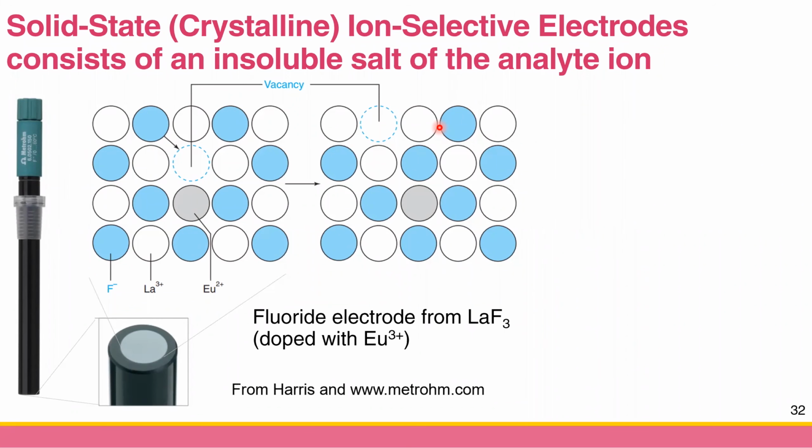For example, if we want to measure the fluoride ion, then we can use some form of the solid state ionic salt of the fluoride ion.